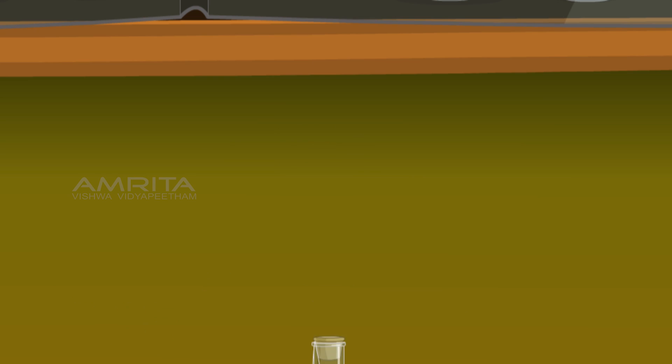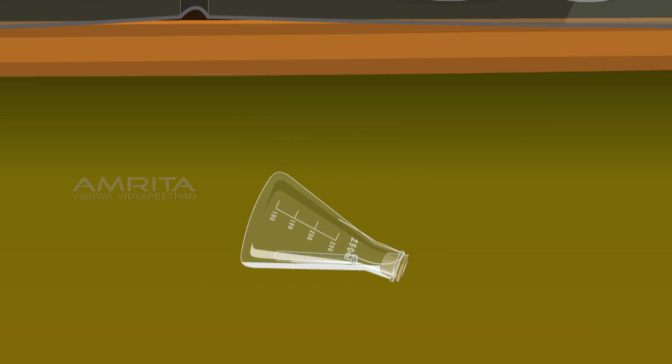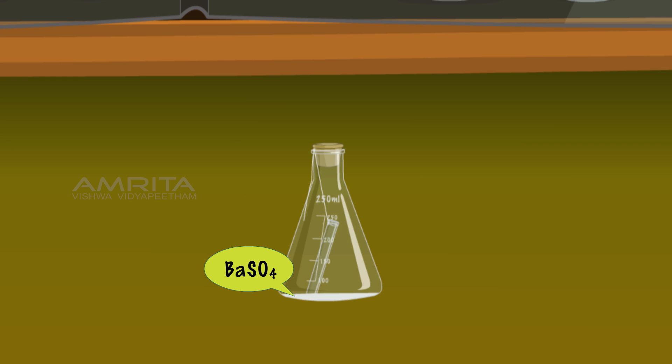Take the flask from the balance, tilt it and swirl the flask so that barium chloride solution in the test tube spills and mixes with sodium sulphate solution in the flask and forms a white coloured precipitate of barium sulphate and an aqueous solution of sodium chloride.